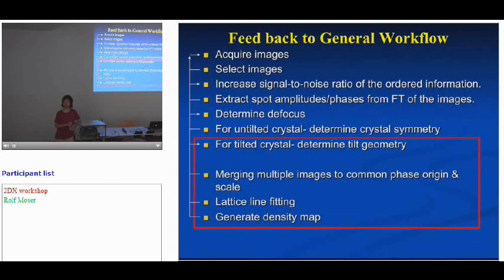Because this fitting is weighted by the signal to noise ratio that's derived from the IQ values. So basically, if the quality of the image is bad, you're not going to get a lot of spots at IQ1, for example, because they are not going to be very strong. So that's where that comes from.